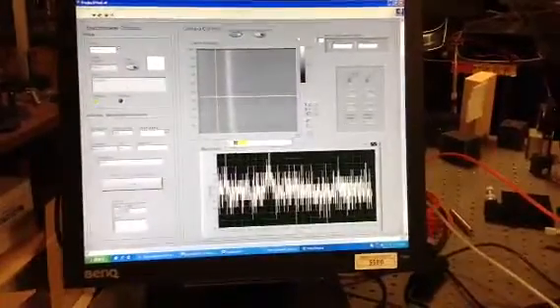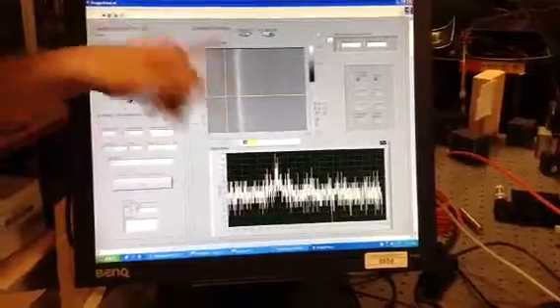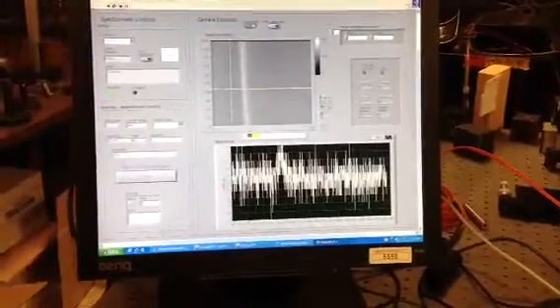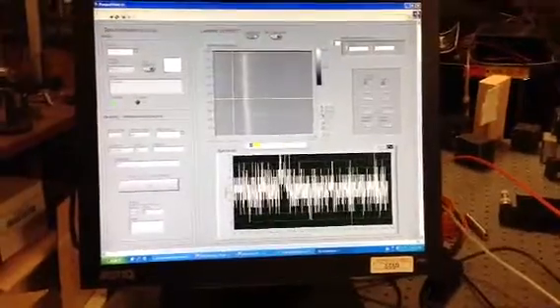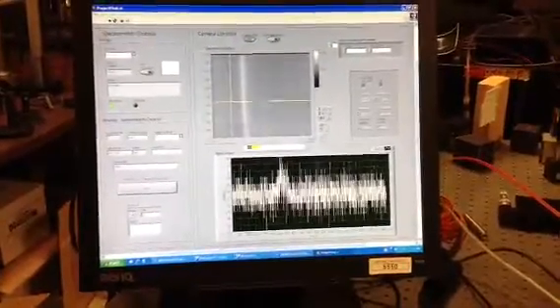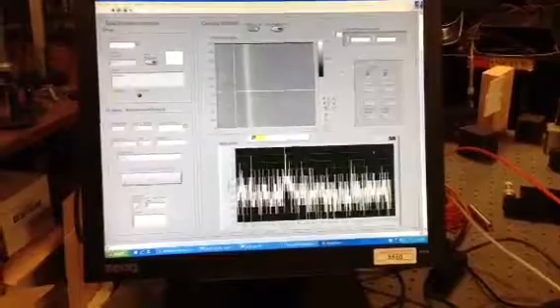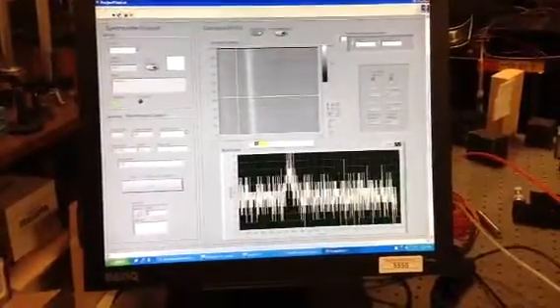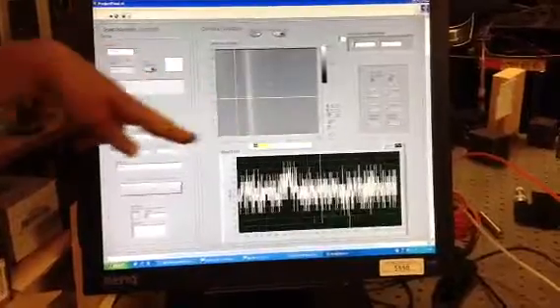And we can see that this is just imaging the slit of white light. We have the capabilities of changing the exposure time. It's currently 100 milliseconds. We also can change the gain of our signal. And then here if we look, these are just spatial coordinates.